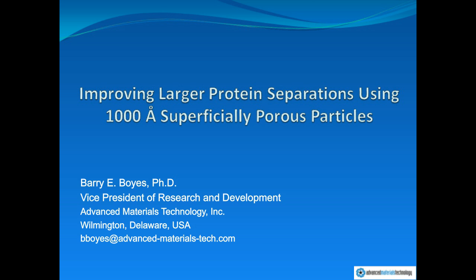Thank you. What is the longevity in terms of number of injections of your superficially porous particle columns? And is there a correlation between the shell thickness and the lifetime of the column?